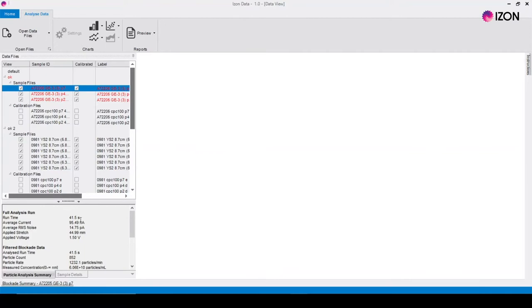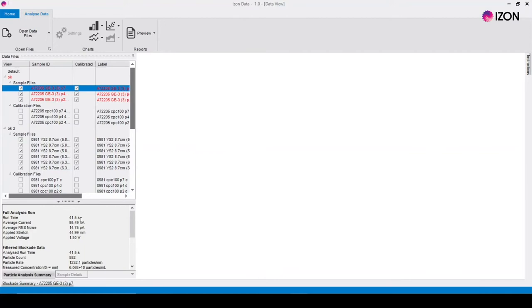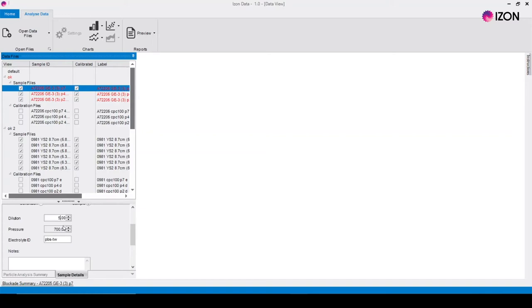Your data sets are divided into sample files and calibration files. If you need to change any of the details about a particular sample this can be done in the sample details tab.